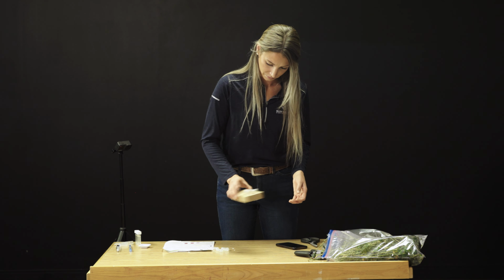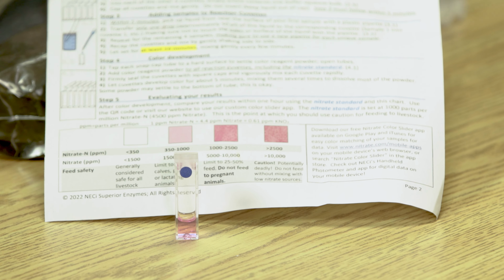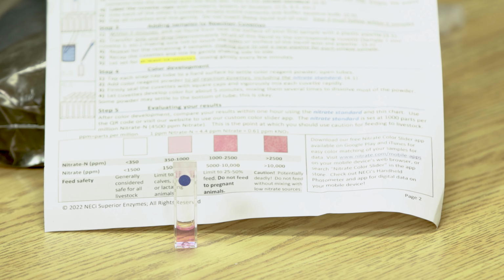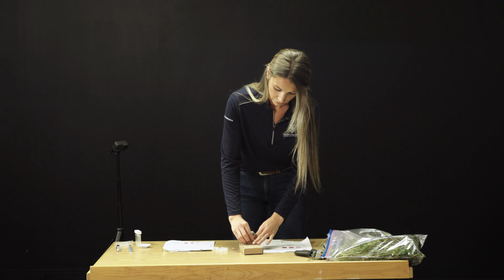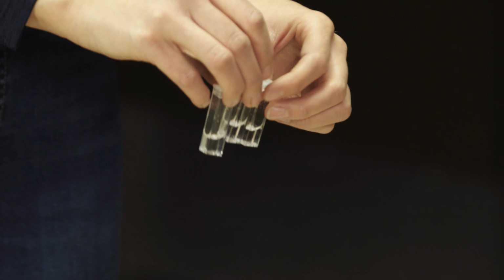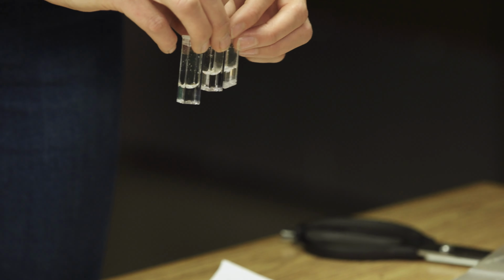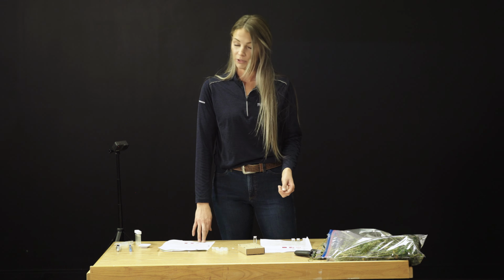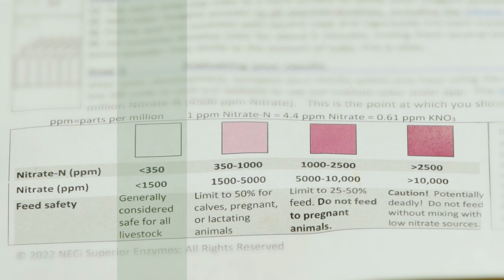After your 5 minutes have been completed, you can compare your tubes to the chart provided. As you can see, the 1,000 part per million nitrate standard shows a light pink, showing that the color reagents are working correctly in the kit. Looking at our other samples, we can see that they are a clear color with no pink present, indicating that they have a quite low nitrate toxicity level and are safe to feed. According to the chart, under 350 parts per million, which these would fall in this category, is generally considered safe for livestock and can proceed to feed.